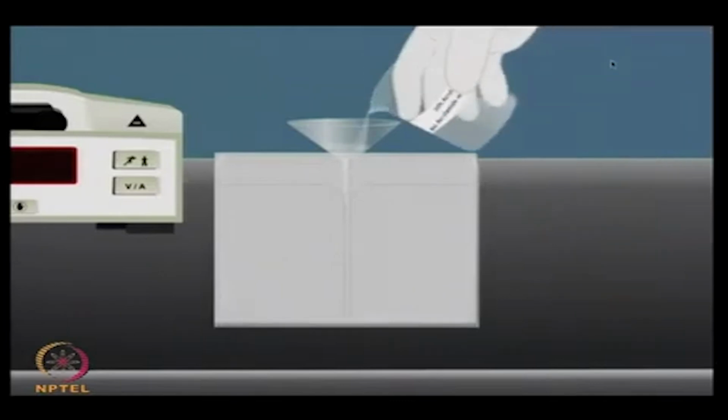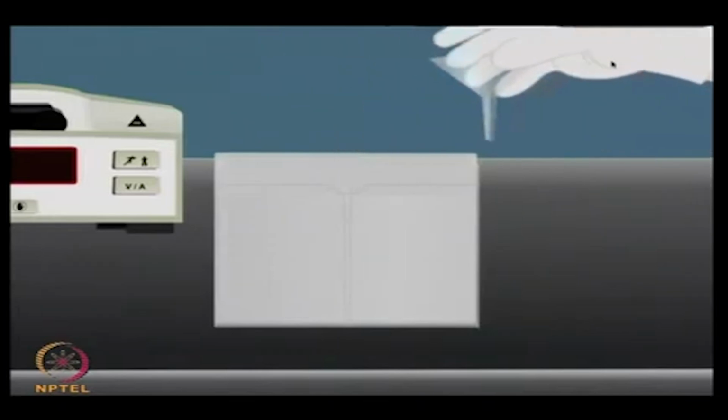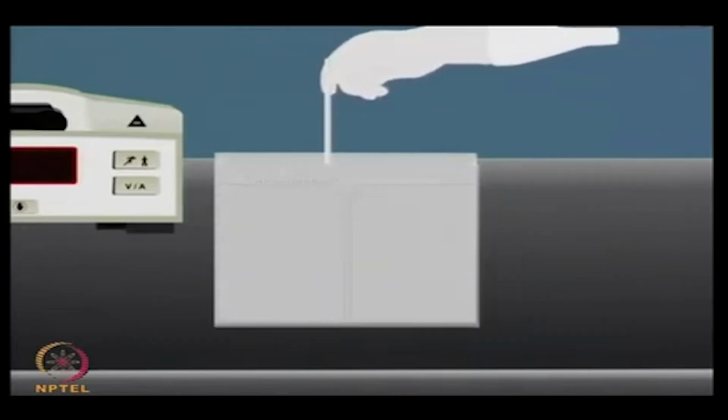So, SDS-PAGE, which constitutes the second dimension of two-dimensional gel electrophoresis, involves assembly of the gel apparatus, gel casting, equilibration of IPG strip, followed by placement of the IPG strip on the gel and protein separation. So, prepare the gel casting solution consisting of acrylamide, bisacrylamide, Tris chloride, SDS, APS and TEMED.